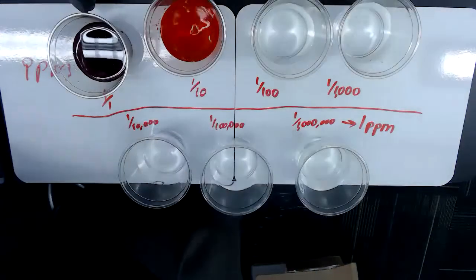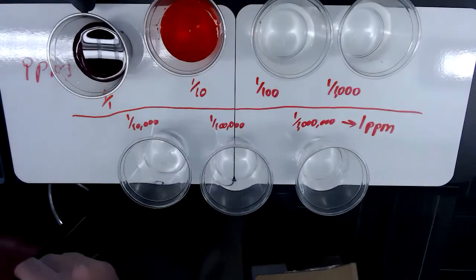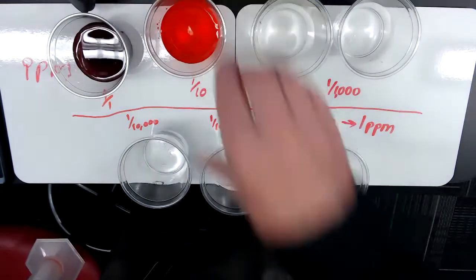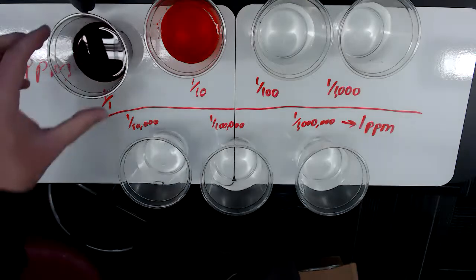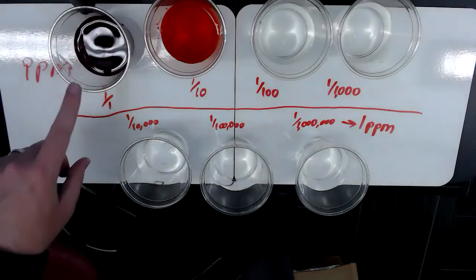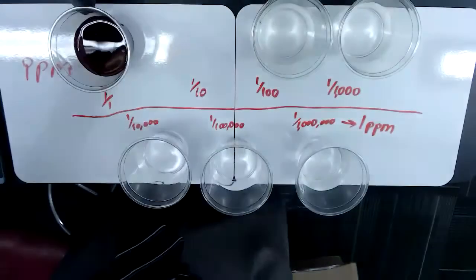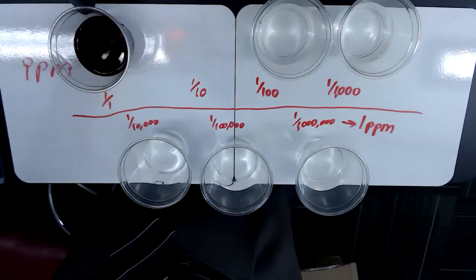Now this drink mix has some dissolved solids in it, right? But you can see the concentration has gone down quite a bit from 1 part per 1 to 1 part per 10. Okay. Now we're going to take this and measure 10 milliliters. Oops, a little too much.